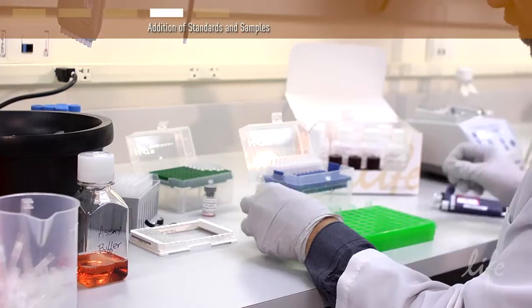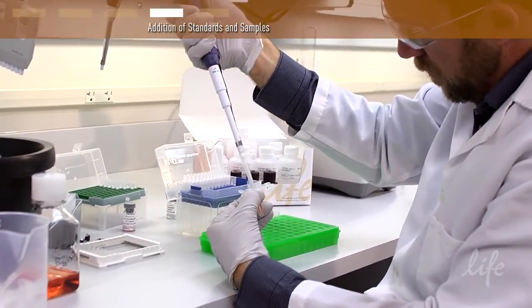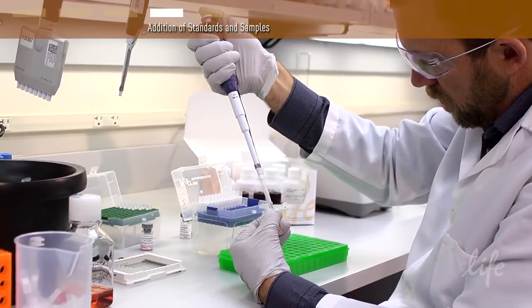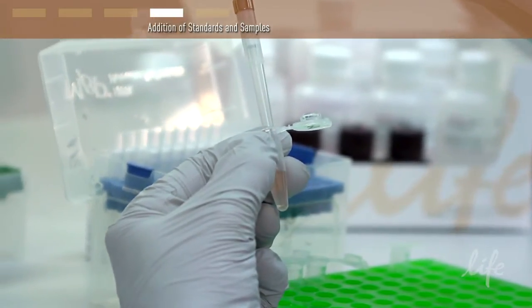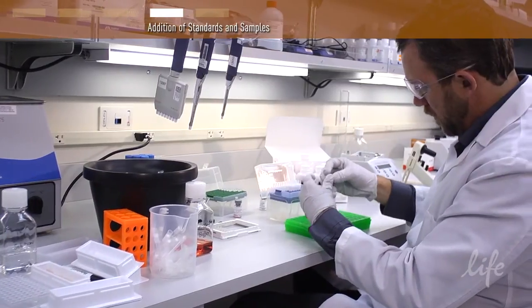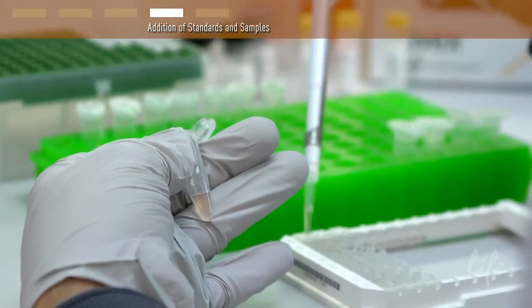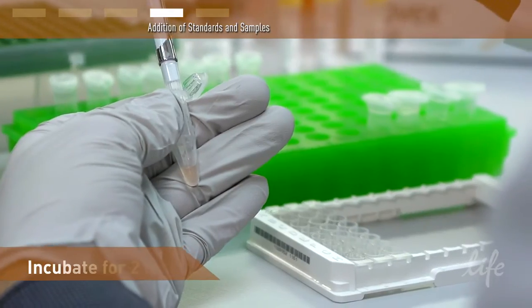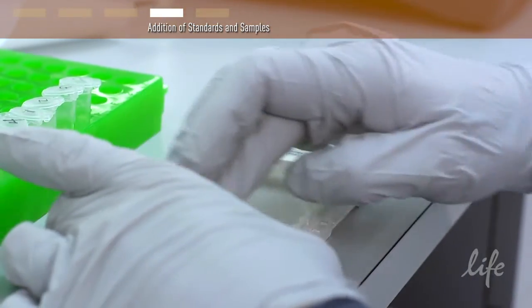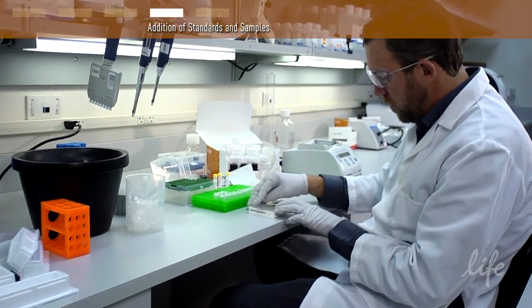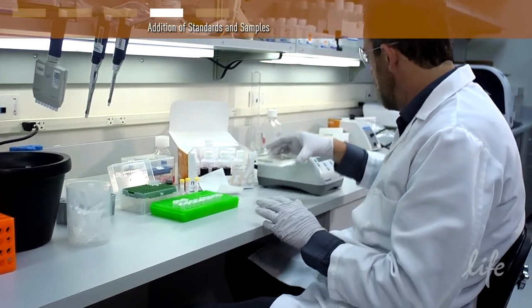Samples may require multiple dilutions to capture signal within the quantitative range of the assay. We recommend diluting 1 to 2 in buffer used to prepare the standard curve. Samples should also be run in duplicate. Add standards and samples to the plate and incubate for 2 hours. It is recommended that you cover the plate and incubate it at room temperature with shaking at 700 RPM. Do this for each incubation step.